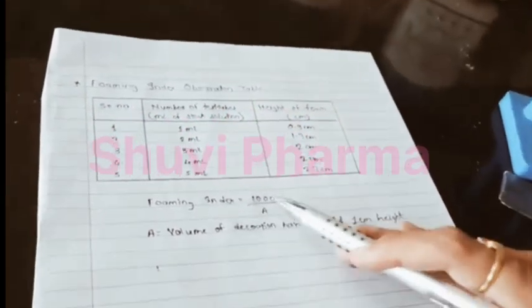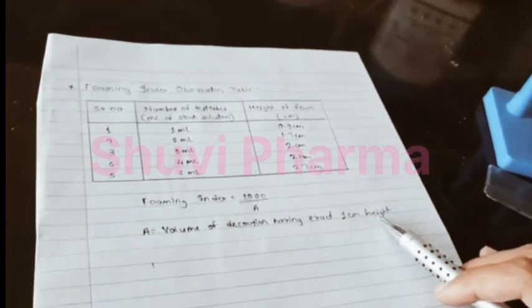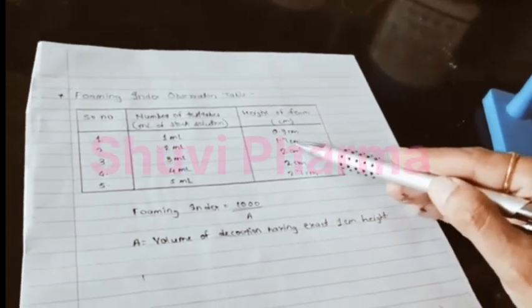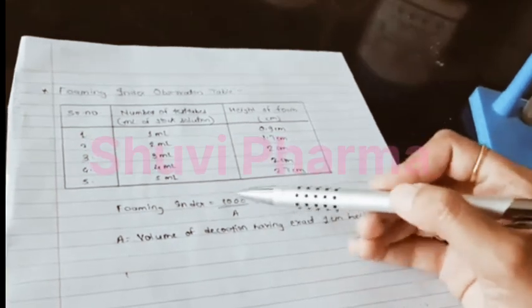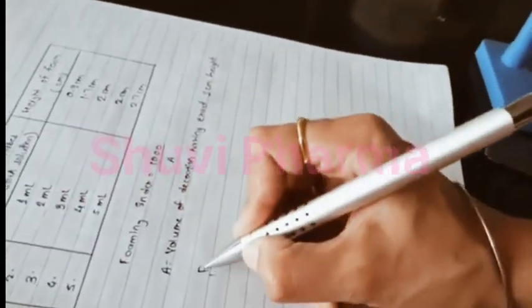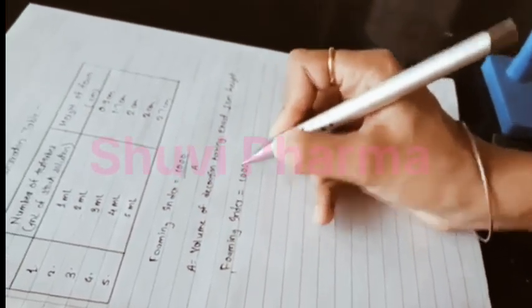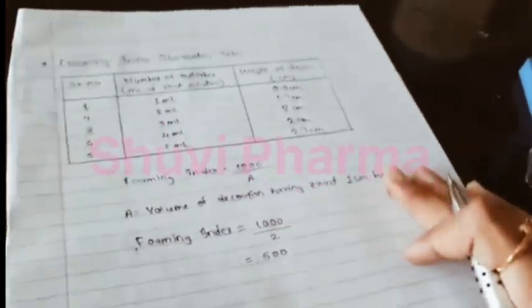Formula for foaming index is 1000 upon A, where A is known as volume of decoction having exact 1 centimeter height. Over here we can consider that 2 ml of stock solution is having 1.7 centimeter of height. So here in case of foaming index calculation, 1000 upon 2 we can take. So we will calculate the foaming index now. 1000 upon 2, so that our foaming index is 500.